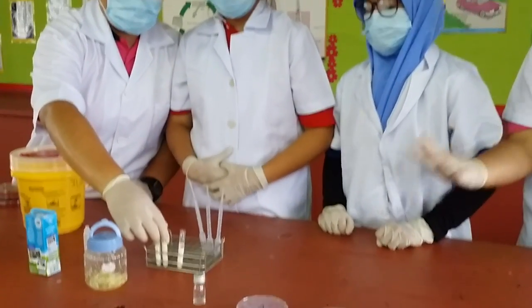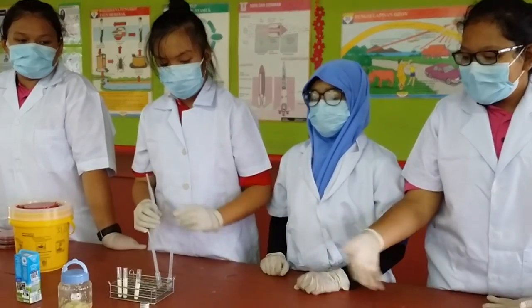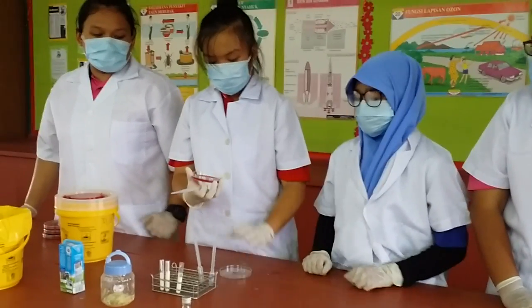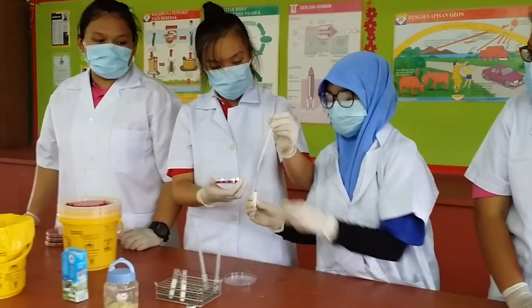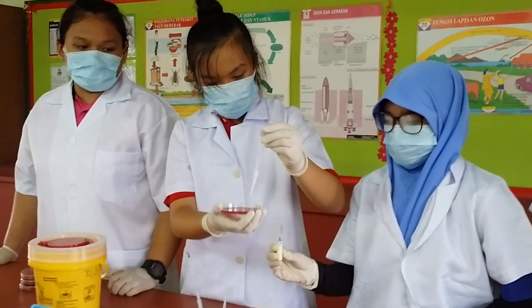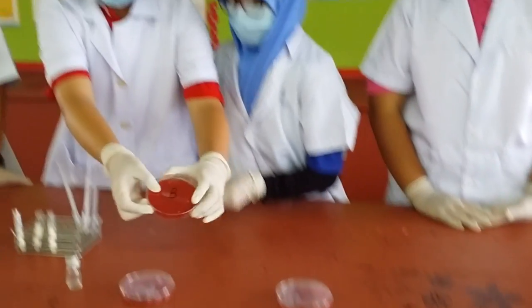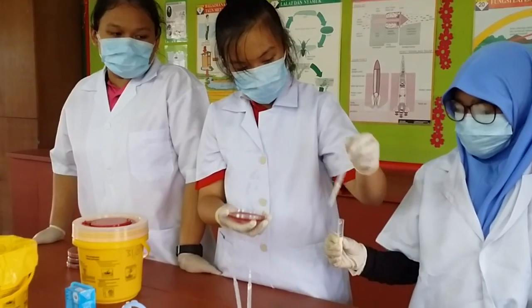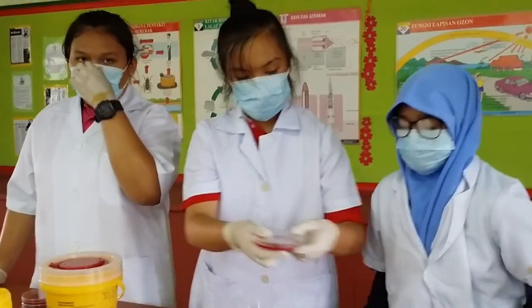After finishing mixing all of it, we use the pipettes to transfer the milk from the test tube to the agar petri dishes. First, the test tube A. Second, the test tube B. And lastly, the test tube C.